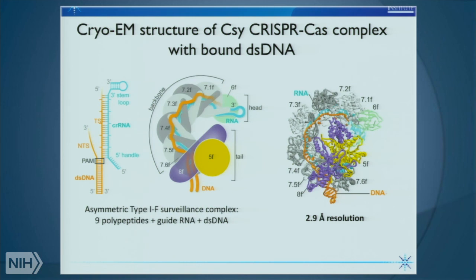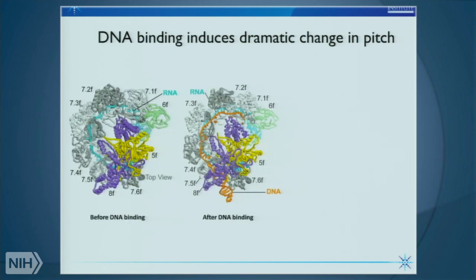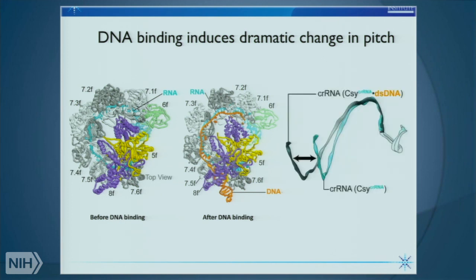Yet again here, dynamics is really what was interesting. When we compare the structure of the complex before and after bound DNA, there's this dramatic change in pitch that you can appreciate with the structure on the right-hand side. Essentially, the binding of the DNA leads to a reduction in pitch. Essentially, it closes and opens with the binding of DNA. And this ability of these complexes to be modulated by DNA binding is very likely significant functionally.